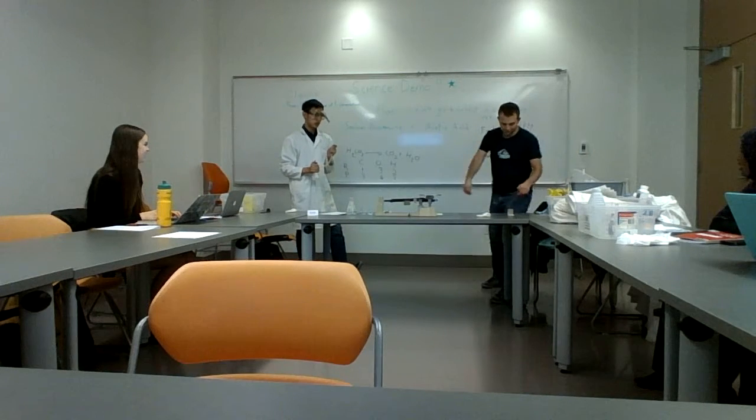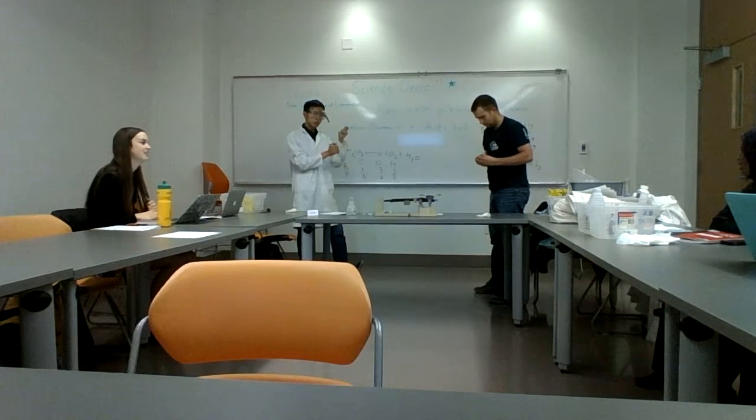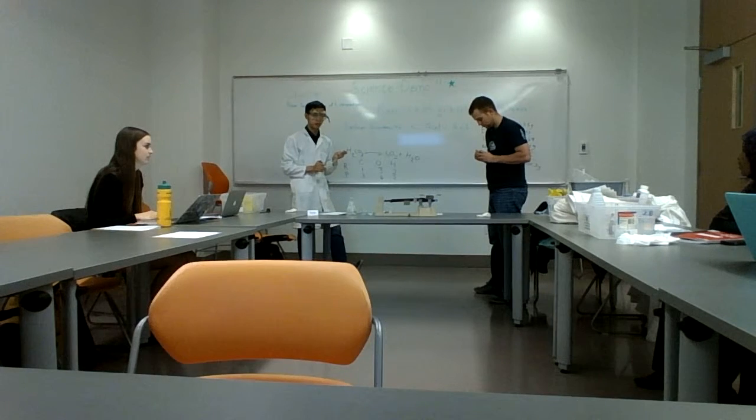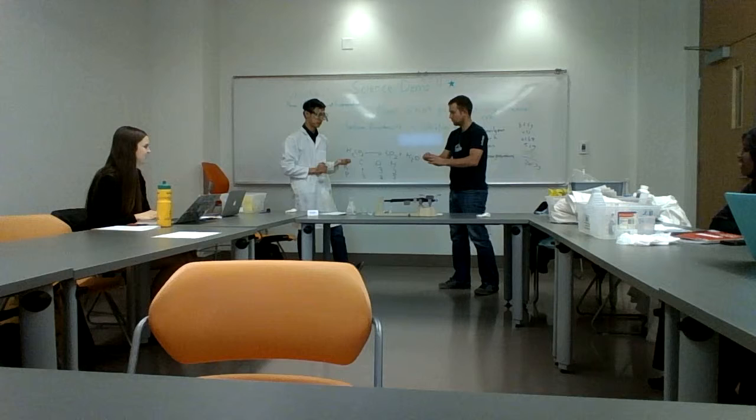So Ben, can you turn it off and flip up the match for me, please? Sure. So Ben right here is going to light a match to create a flame. And you propose that this gas is what? CO2. But are you sure it's CO2? Well, we've got to make sure. How do you know there's no oxygen here instead?